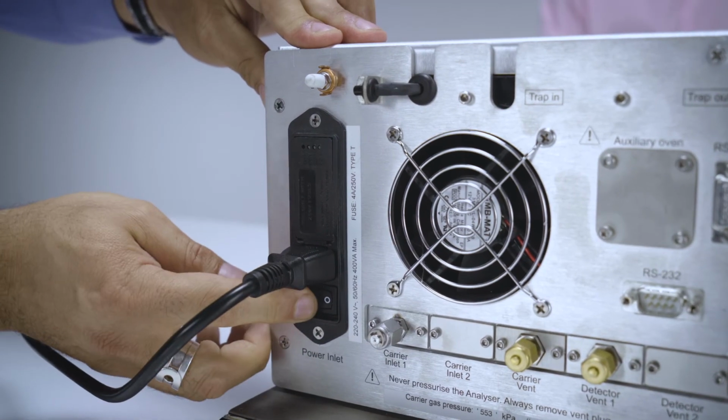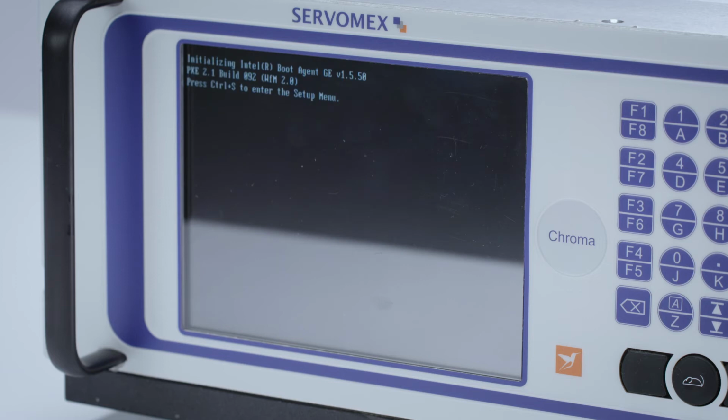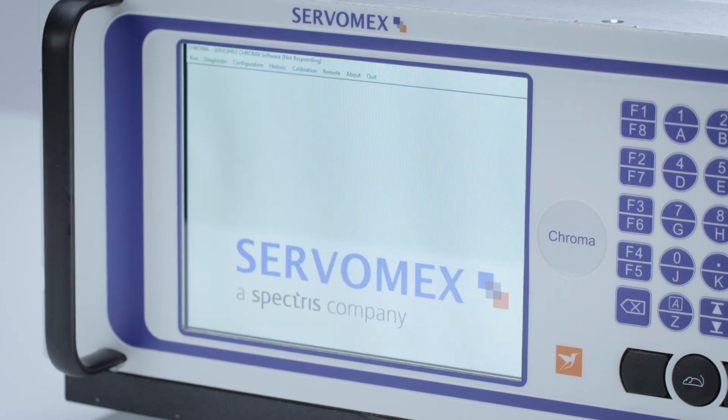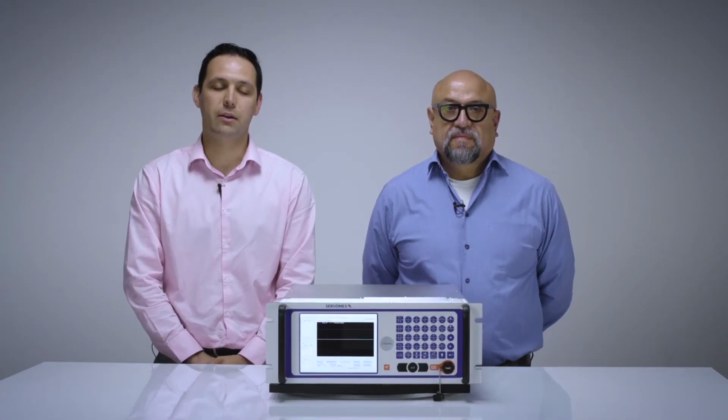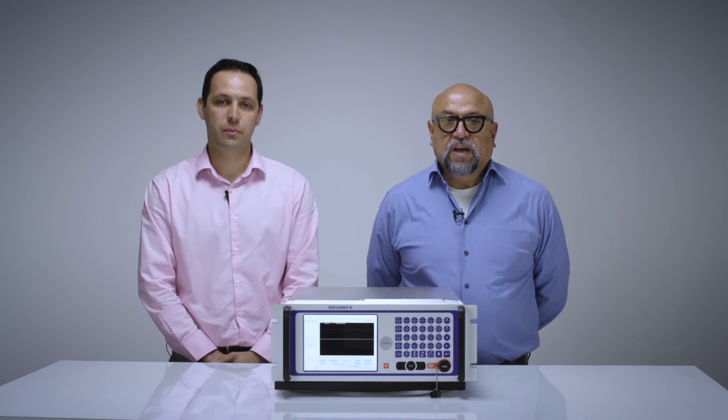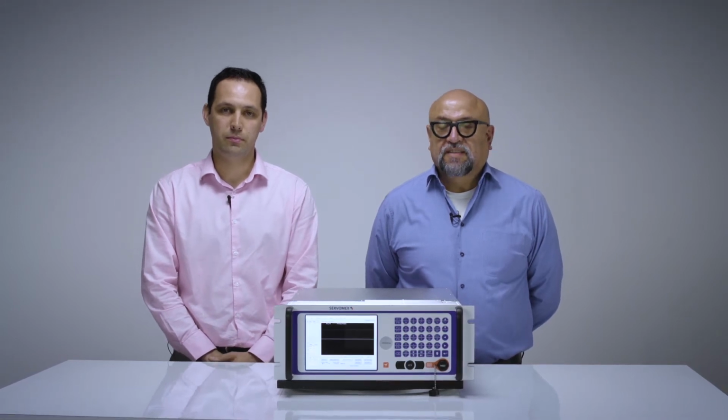And now we are ready to connect the analyzer to power it up. It's important to note, before you power up or connect carrier gas, you must remove all vent caps to prevent damaging the analyzer. We also recommend the use of the SERVOPRO pure gas to ensure quality of carrier gas. Once powered up, the analyzer should be purged for at least 24 hours before use to ensure any contamination from the atmosphere, nitrogen, carbon dioxide, etc. has been removed.